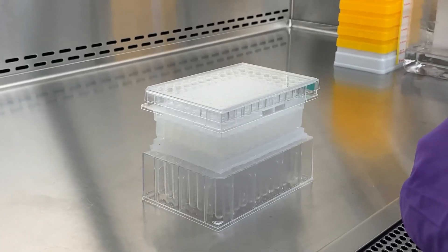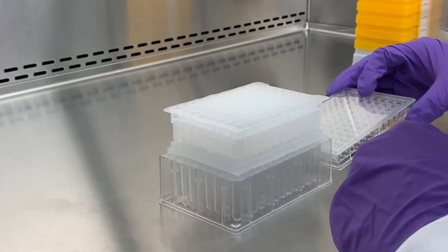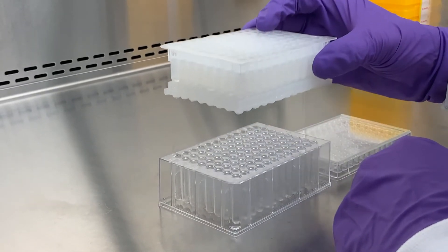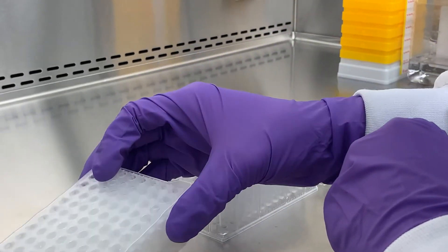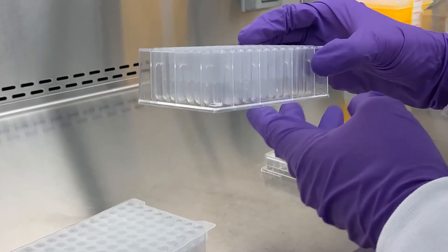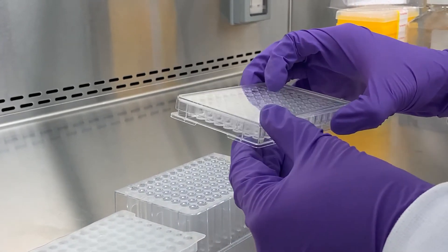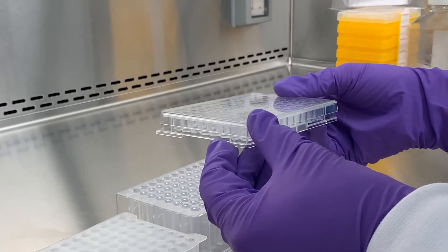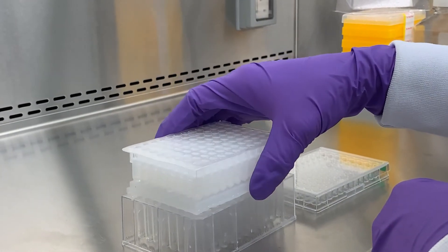The kit is shipped as a compact stack of components. The kit includes an ExoSpin 96 plate, a waste collection plate, and a sample collection plate for storage of isolated exosomes. There's also a user guide to direct you through the simple isolation process.